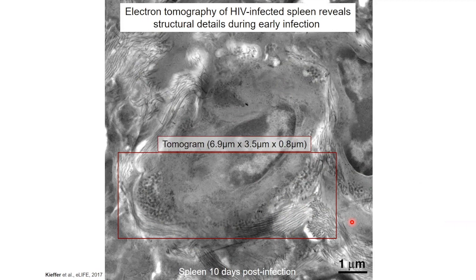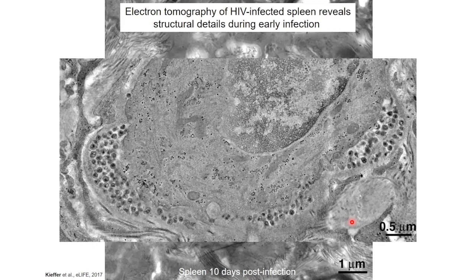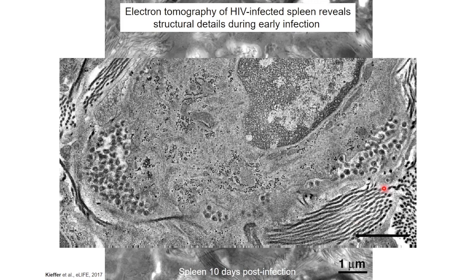What we can actually make out is individual viruses that are being produced by the cell. You can even see, my cursor's not working that well, but over in this pocket down here, there's a few viruses that are actually in the process of being released from the cell. Let's see if this ends up playing here. We might just get a couple bits and pieces of this, it's chugging through, but this should be very smooth, and I can show everyone later.